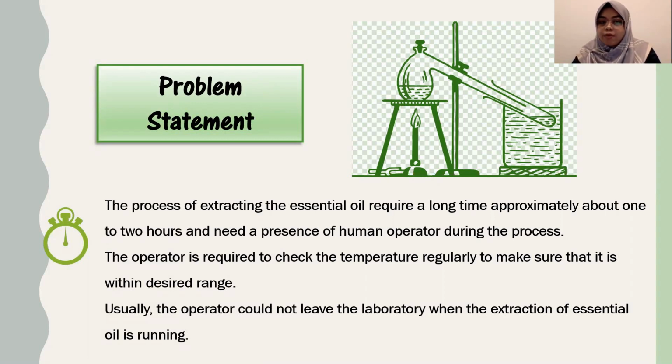So this operator, she or he, cannot do anything besides monitoring the temperature during the extraction process. The operator could not leave the laboratory until the extraction process is finished. She cannot go to have lunch, or go to the toilet.